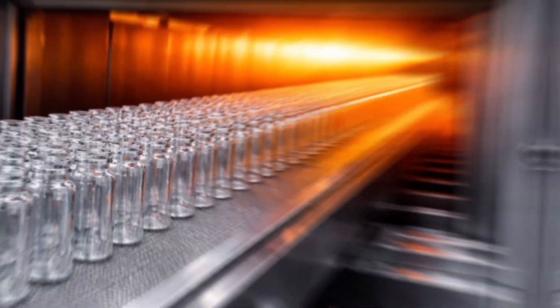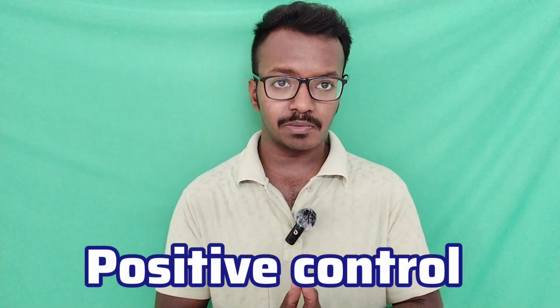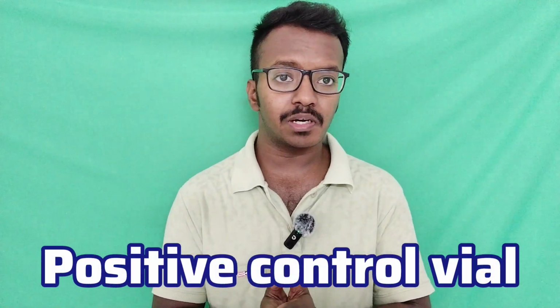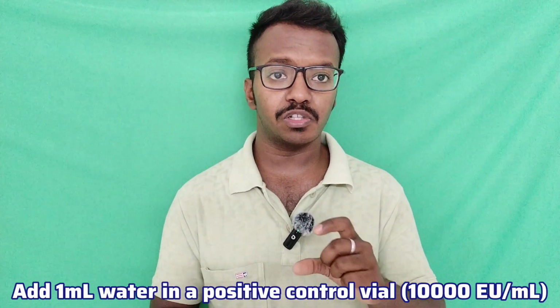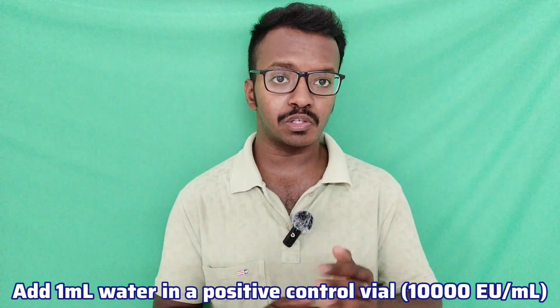After drying, all these vials are subjected to the depyrogenation process except one vial. The remaining one vial is considered as a positive control. After completion of the depyrogenation process, the exposed or baked vials and the remaining one positive control vial are analyzed. First, we need to prepare the standard curve using the unbaked or positive control vial. We know the positive control vial contains 10,000 EU. So, add endotoxin free water into the vial and vortex well for 10 to 15 minutes. Now, the vial contains 10,000 EU per ml.